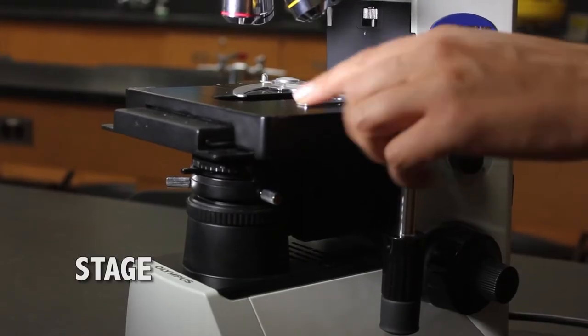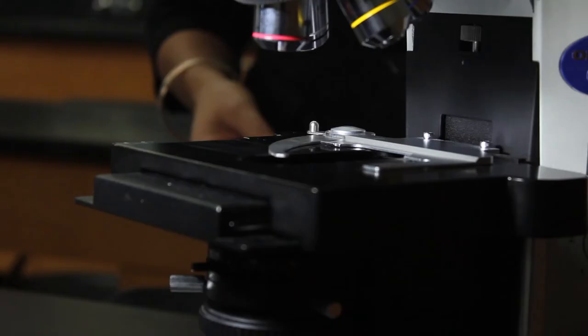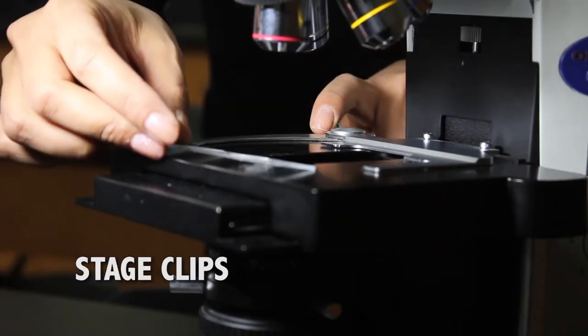Stage, this supports the slide. Stage clips will hold the slide in place.